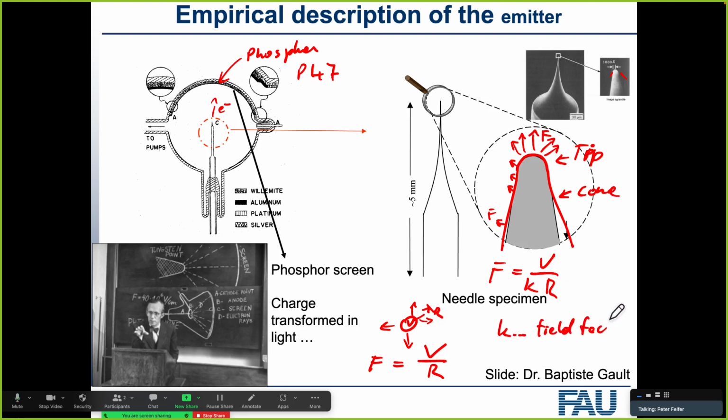Of course, these days you could just set up a simulation and try to simulate that very easily, because nowadays our laptops are about as powerful as supercomputers were in the 70s, so it's not that big a deal anymore to try and simulate what the actual field distribution is. And I'm currently setting up a simulation like that in MATLAB, and I hope I'm going to be able to contribute it to the lecture before the end of it if I get to it.